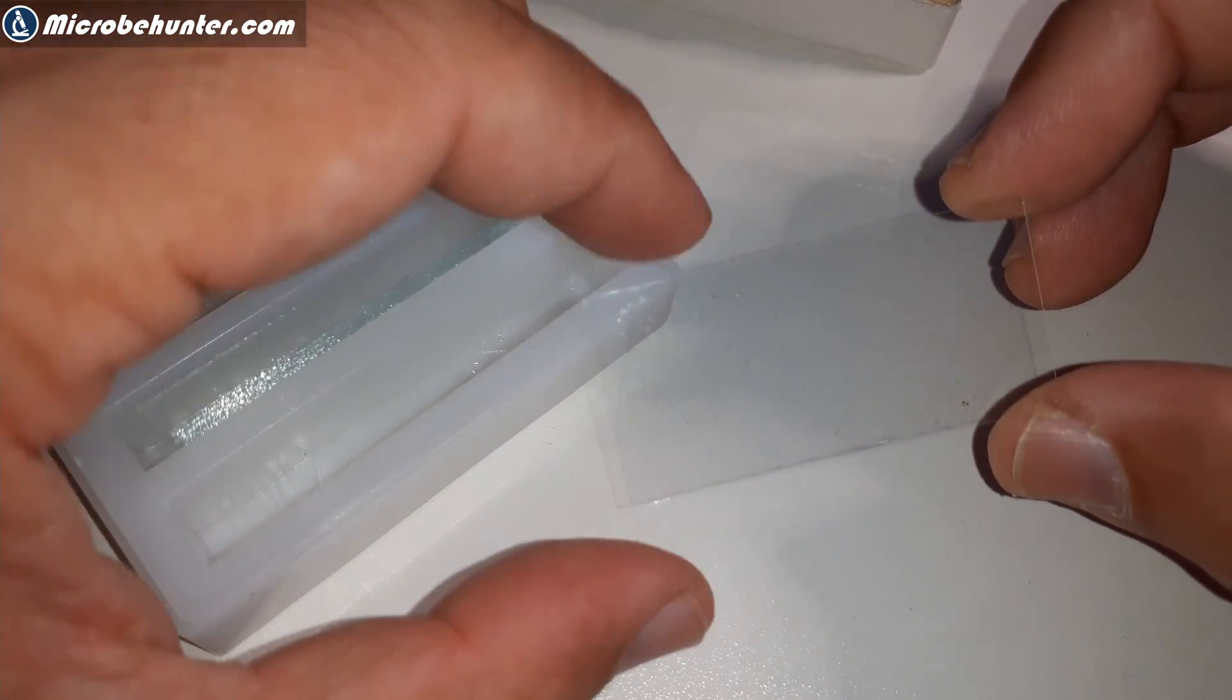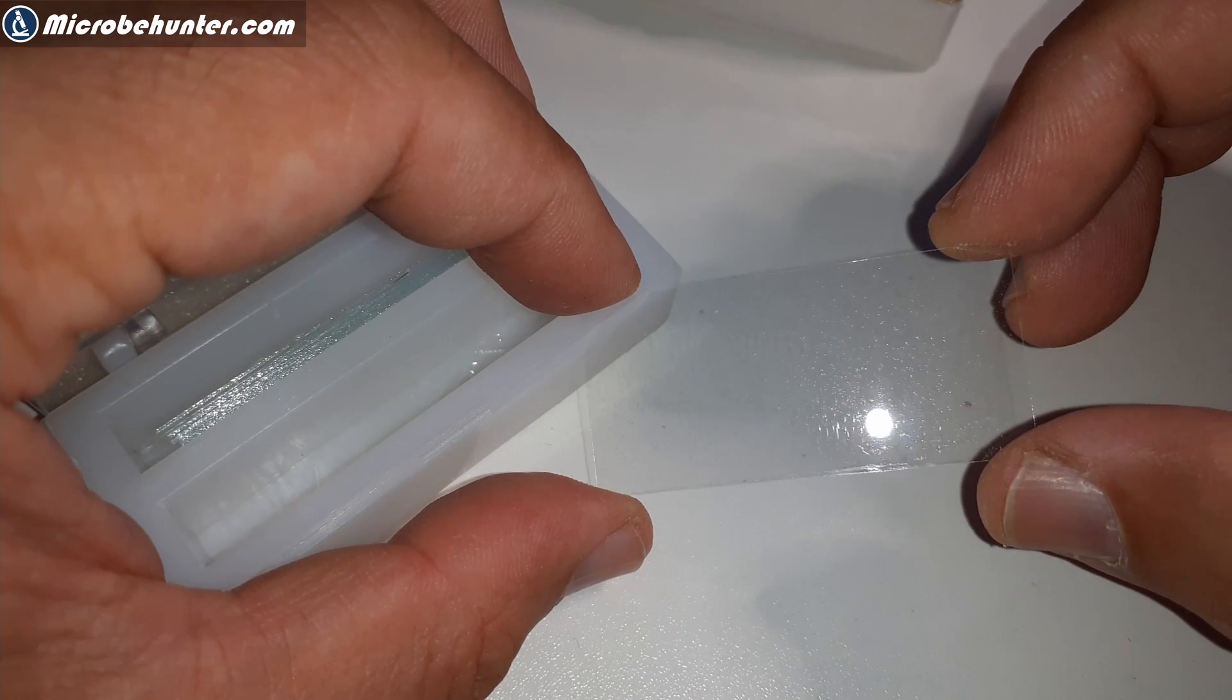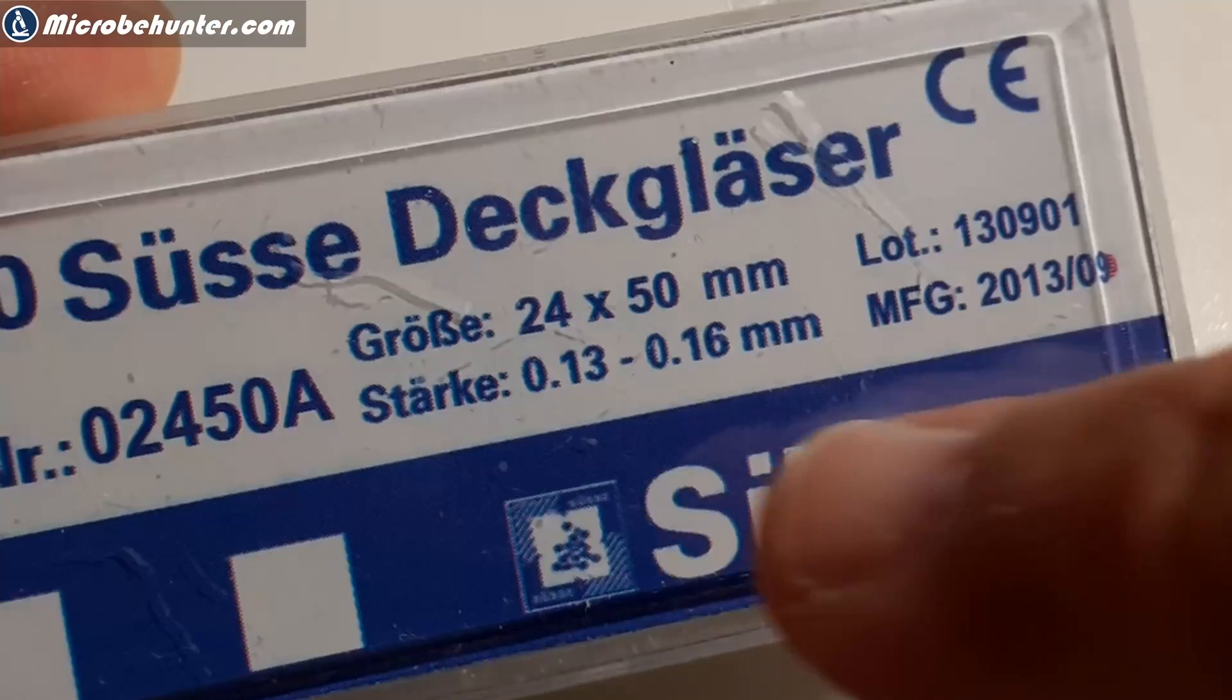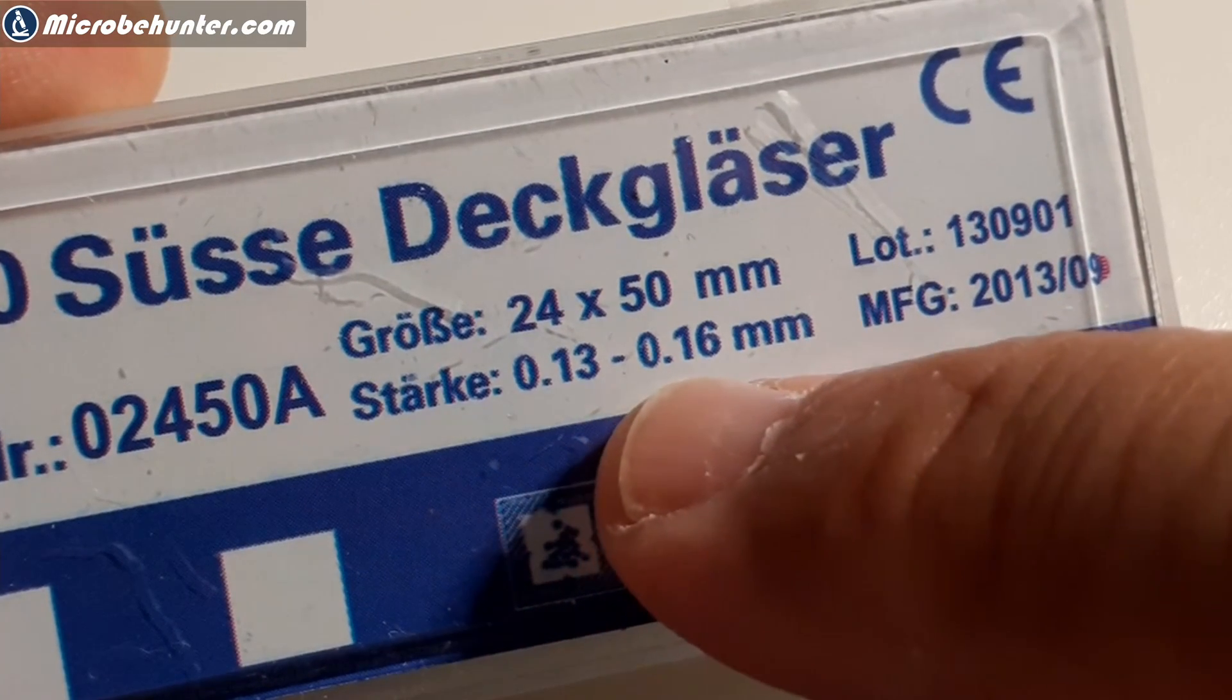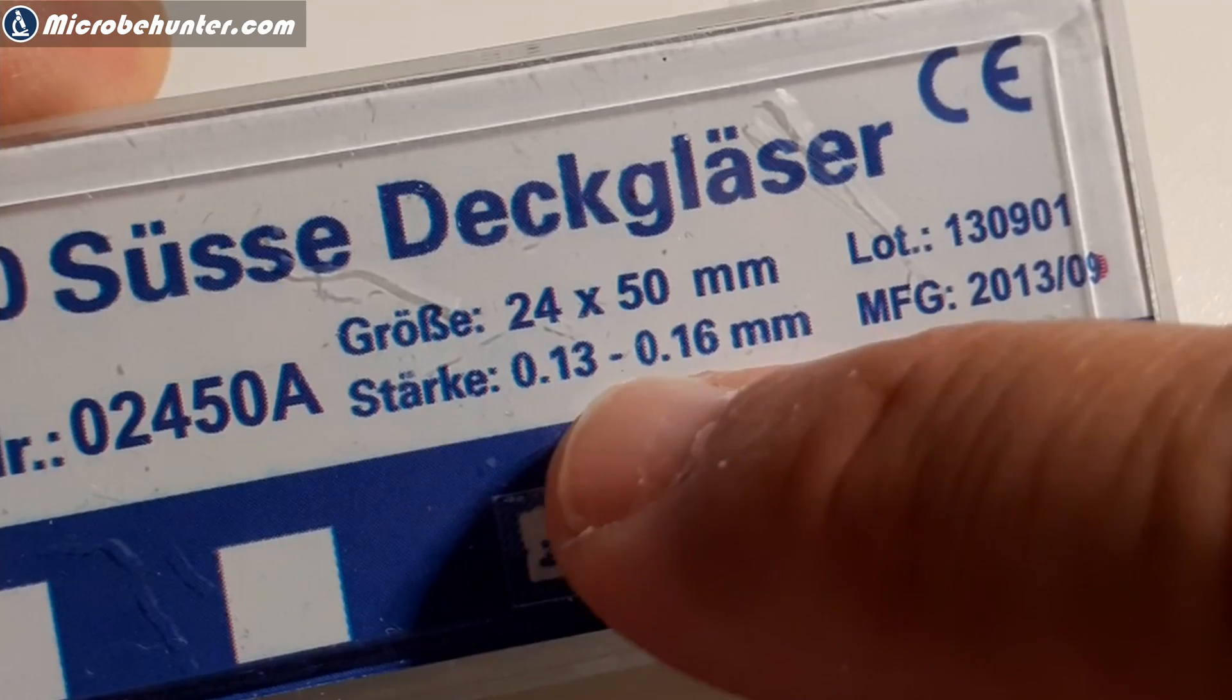These are pretty large cover glasses, and I also reuse them. Here you can see again it's not quite clean—you have to dry wipe them as well. I like to use them a lot. The thickness is 0.13 to 0.16 millimeters, and the size is 24 times 50 millimeters.